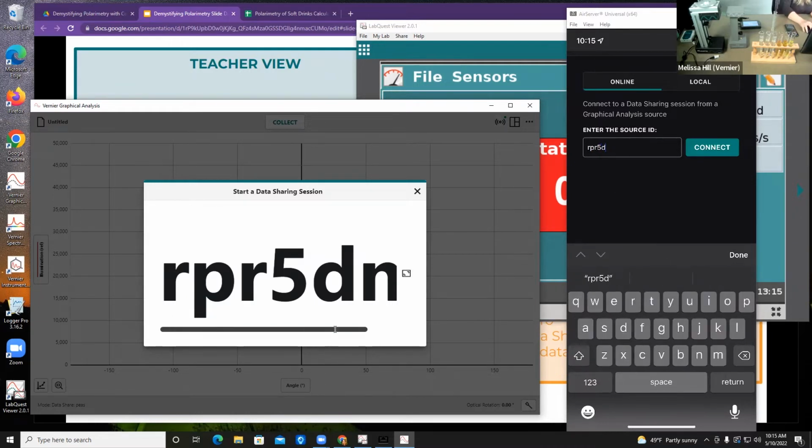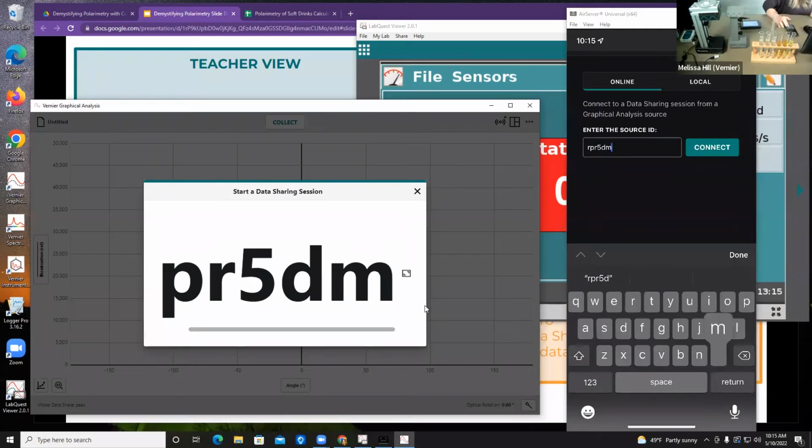And then I'm pretty sure that's an N. Oh, nope, it's an M. Always got to go to this side. And connect.